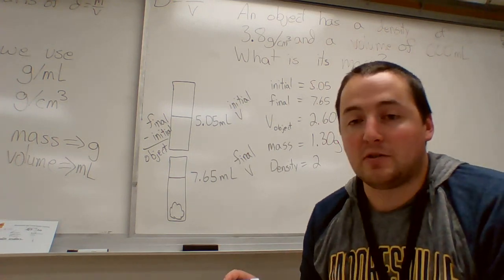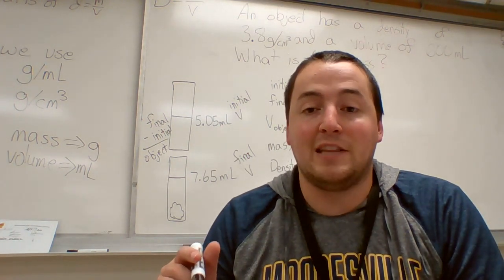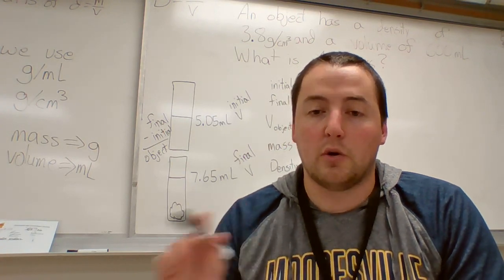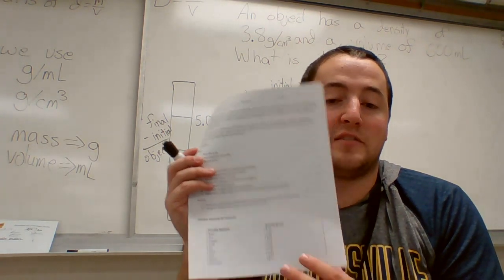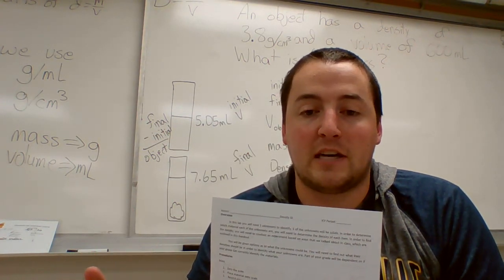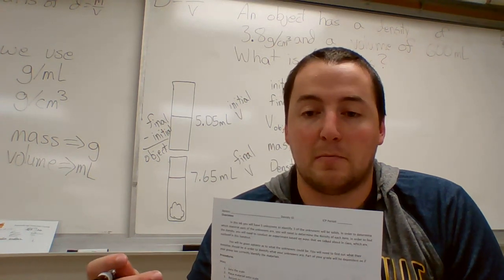But for this particular lab, once you guys start getting the data, all of these objects are going to be on this list somewhere. Okay, so you're just going to have to figure out to the best of your ability, based on what you calculated for the density, what that object is going to be.